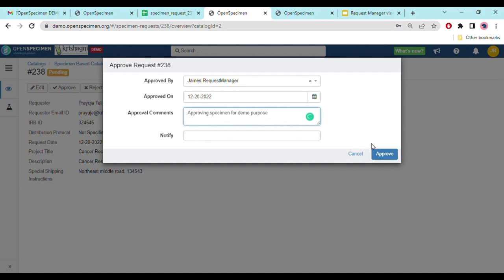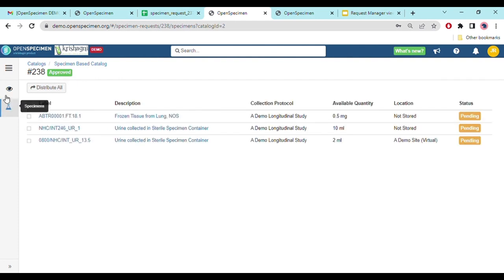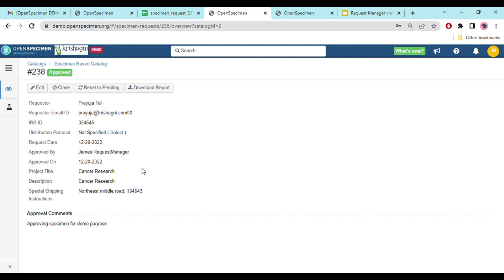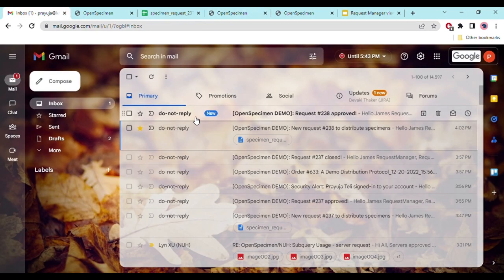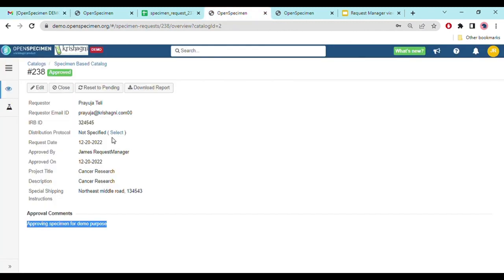You can also specify users to send email notifications to. Once approved, you can see the request status has changed and under the specimens tab the 'Add Specimen' button is no longer visible, and the 'Remove' option is also disabled. The approval comments are shown and the status has changed from pending to approved. The request manager also receives an email notification that request #238 has been approved, including who approved it, the approval date, and comments.